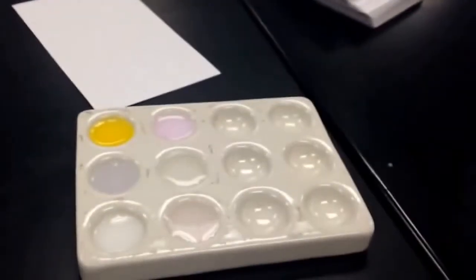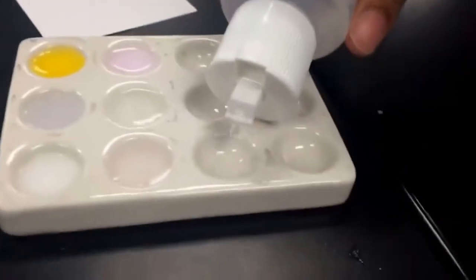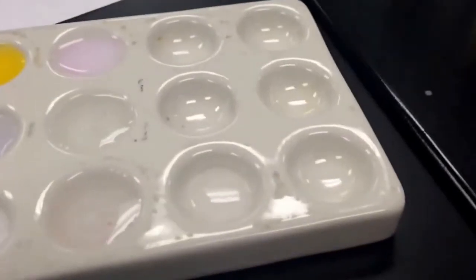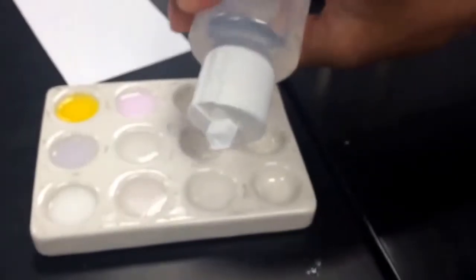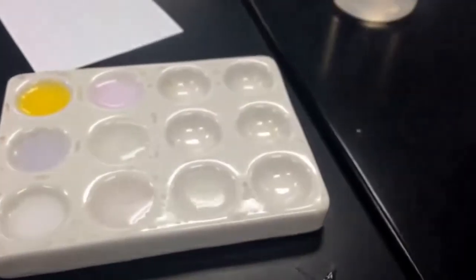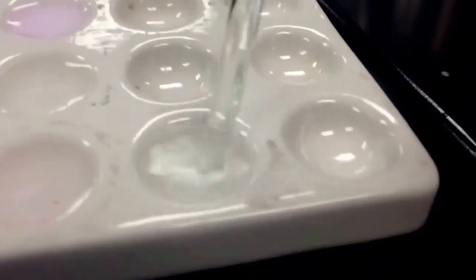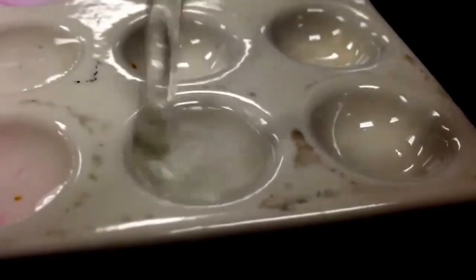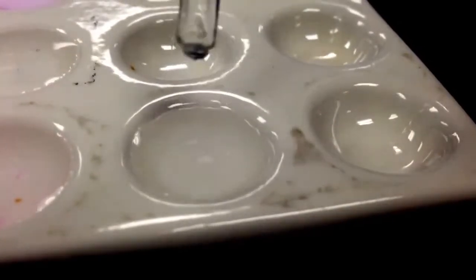Number 7 is sodium hydroxide and acetic acid. So here's the sodium hydroxide. All right, and here is the acetic acid. It almost looks like we mixed water with water, but that is not the case. And we do not see anything. There is no precipitate.